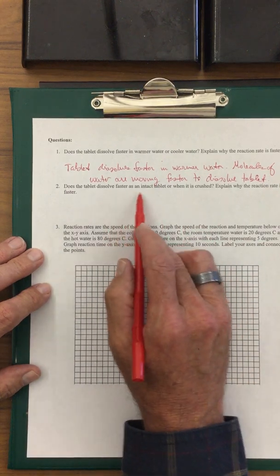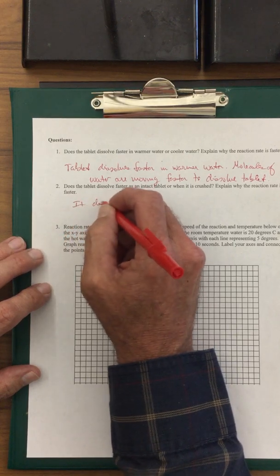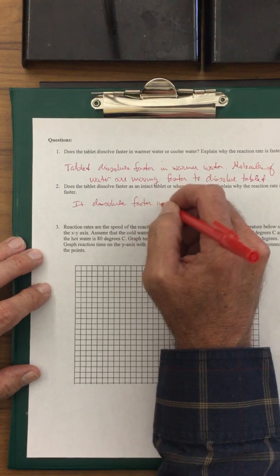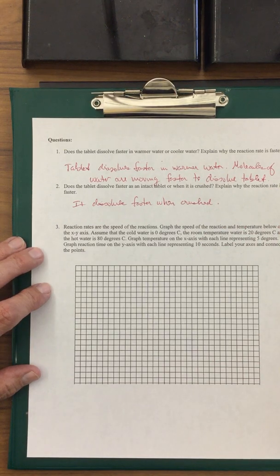Does the tablet dissolve faster as an intact tablet or when it is crushed? It dissolves faster when crushed. Explain why the reaction rate is faster. This is because the pieces are smaller.